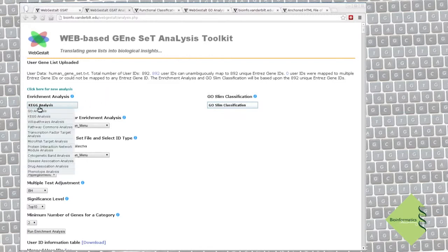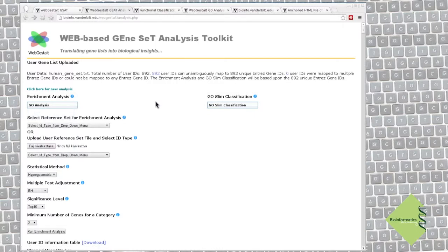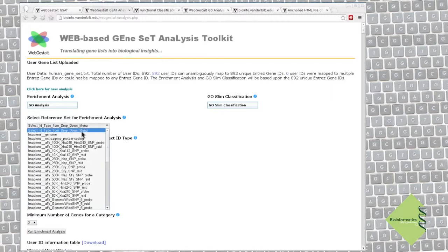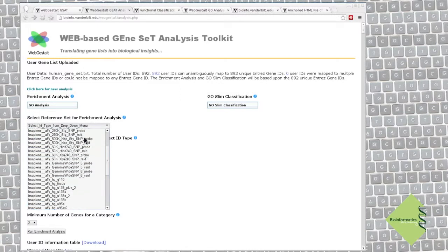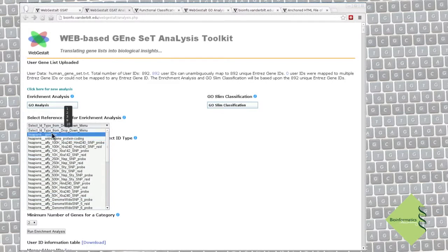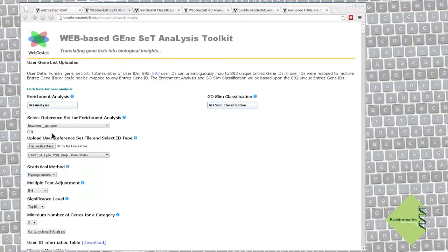Select this analysis type from here. First, we have to provide a reference gene set. Either we can upload a list, or we can select from many preset reference lists. Here we will use all the human genes for reference, and for that we select this item from the drop-down list.